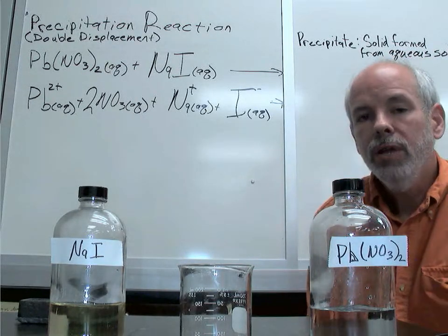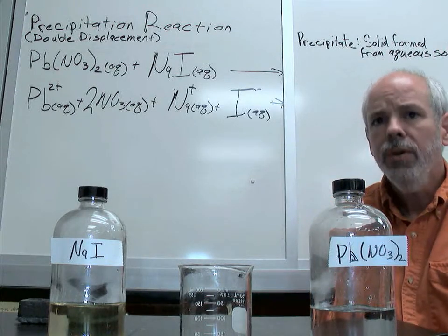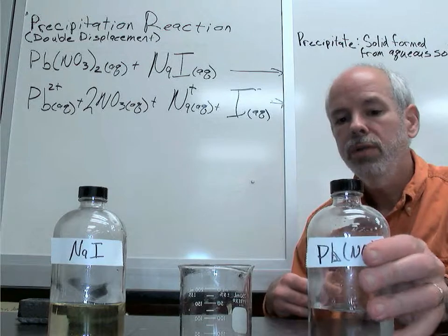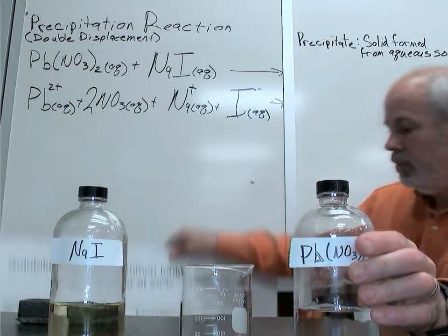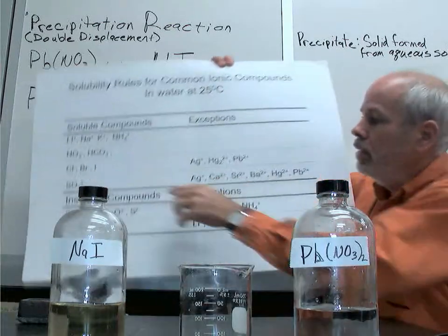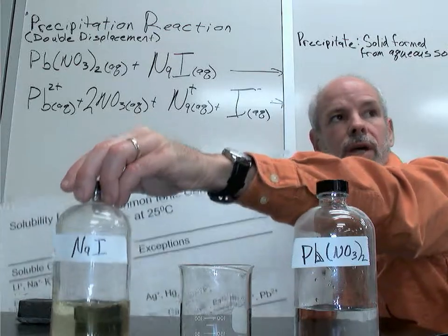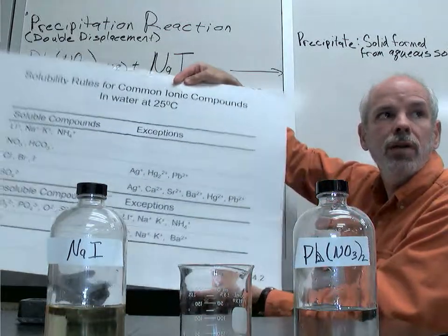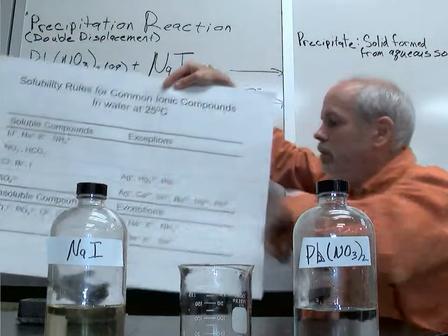Now let's look at chemical reactions in aqueous solutions. I have here a solution of lead nitrate — it's a clear solution, and I'm not surprised because from my solubility table, nitrates are always soluble. And I have some sodium iodide, and I'm not surprised that it's dissolved in water because iodide ions are also soluble.